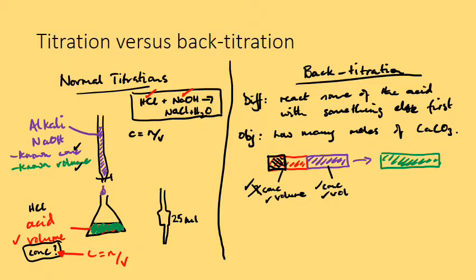So what you do is you do your titration to work out the moles that are left of the acid.